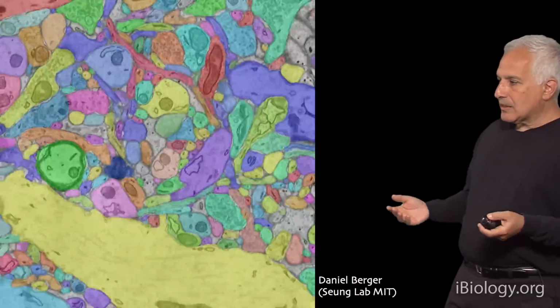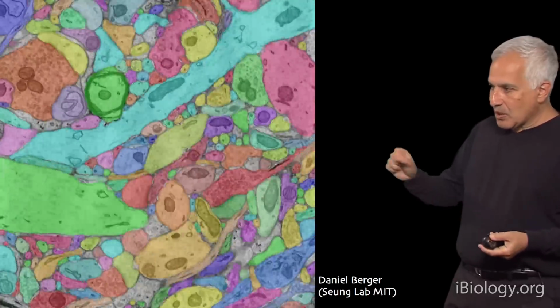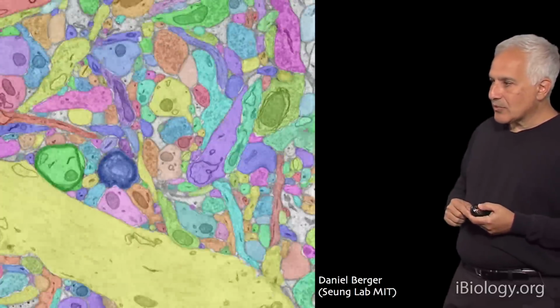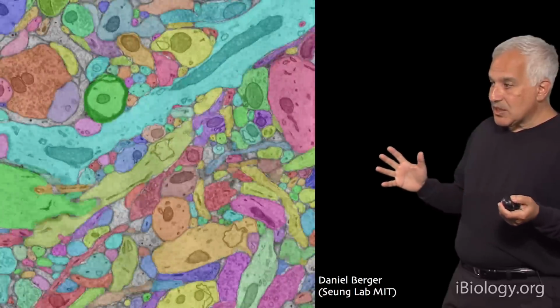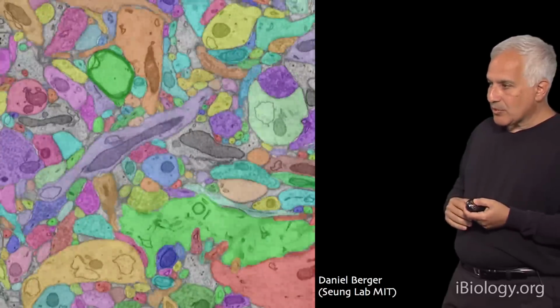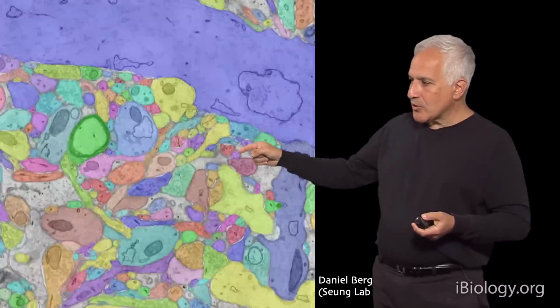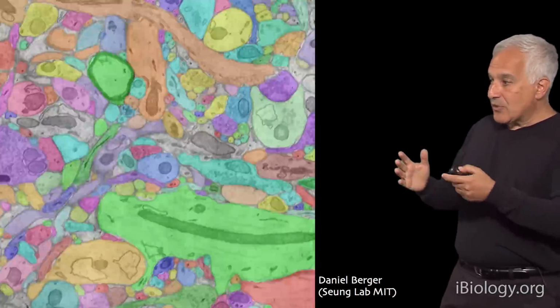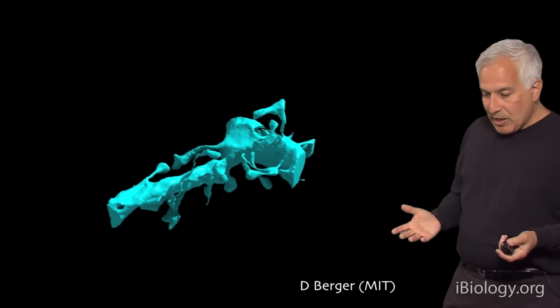So this is a digital coloring book where anyone who wants can go in and color in an object and color it in the same color section after section after section. And you can see that it's easy to follow these objects from one section to another, especially when you color them all in. The gray objects here were also colored in, but we kept them gray because they're the glial cells, they're not neurons. And from this data, you can then generate the three-dimensional version of it.